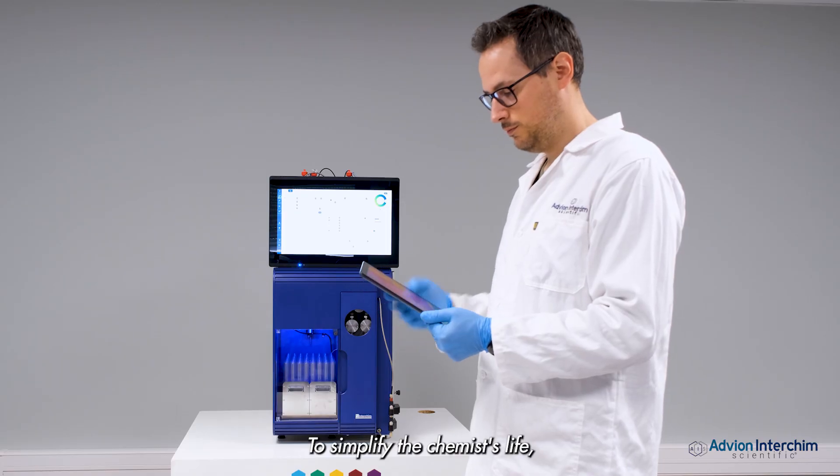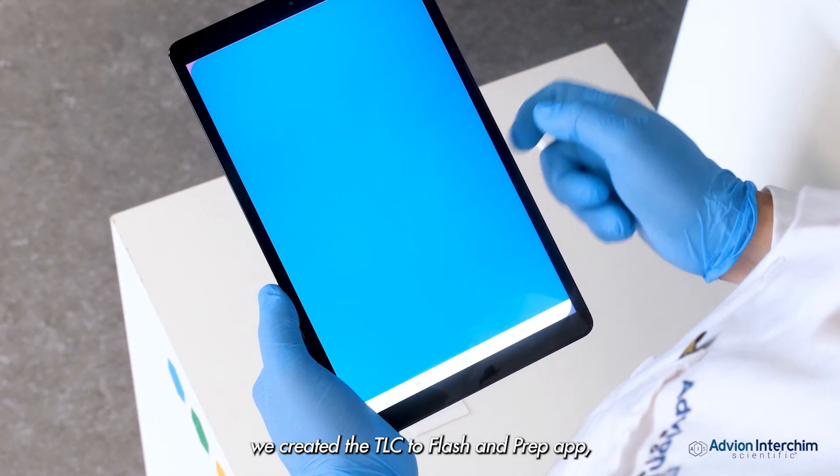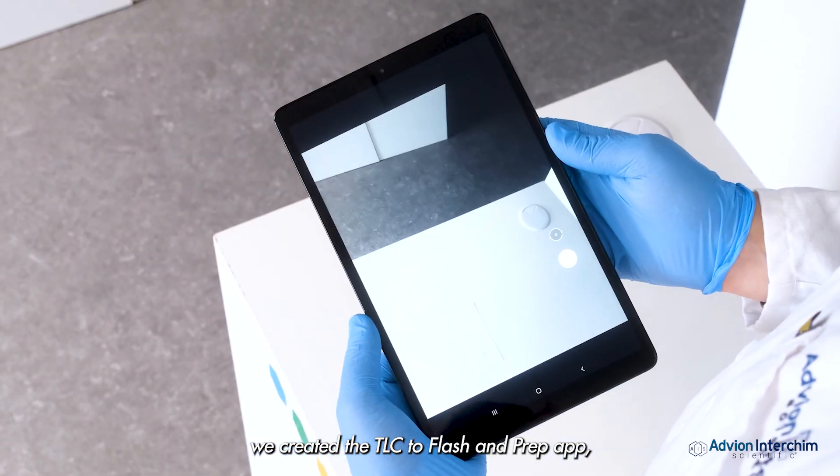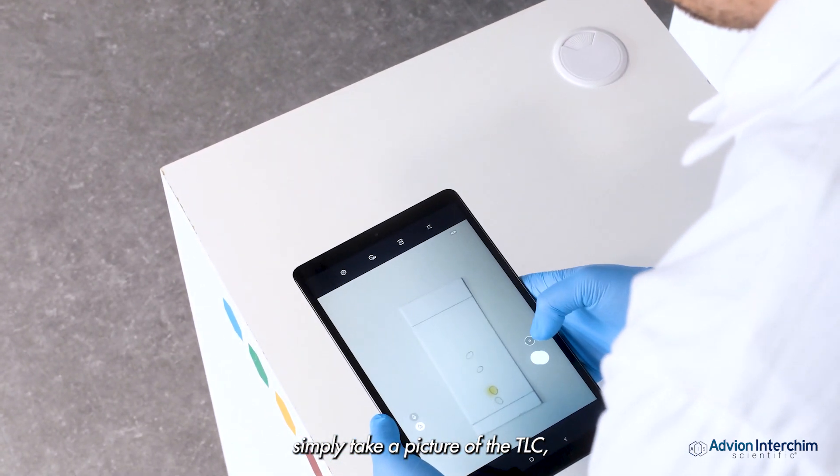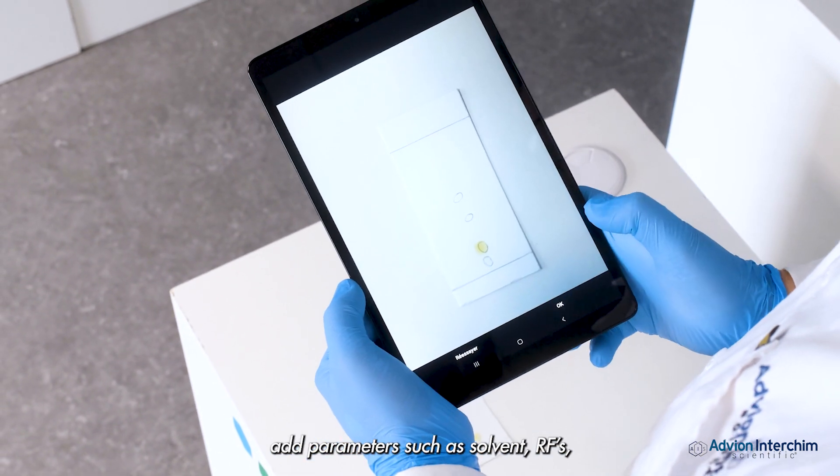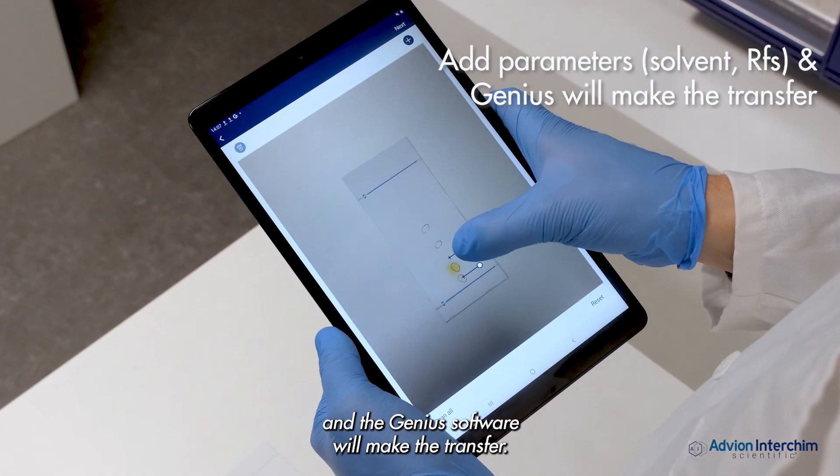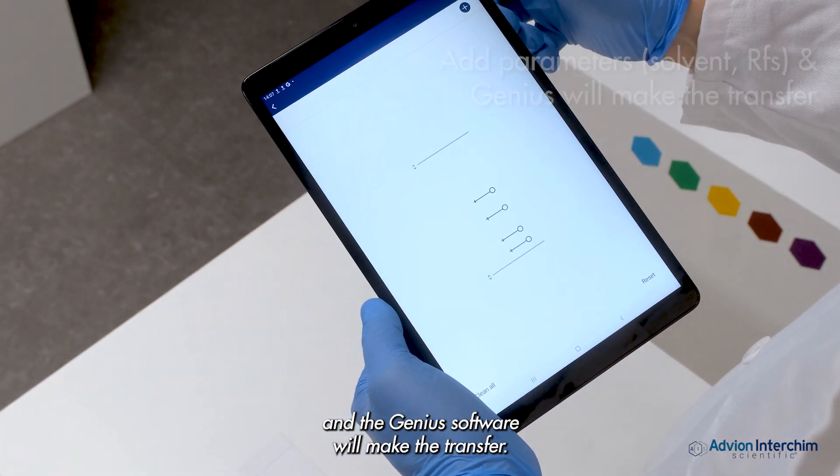To simplify the chemist's life, we created the TLC to Flash and Prep app. Simply take a picture of the TLC, add parameters such as solvent and RFs, and the Genius software will make the transfer.